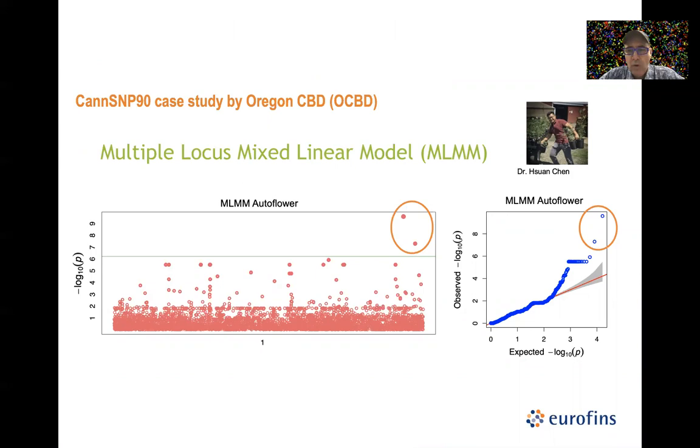After running all those SNP chips that we did a linkage map on, they were careful to select some other interesting cultivars. They looked for some cultivars of theirs that had the autoflower trait. This is important because if you can understand the autoflower genetics, you can get an extra crop cycle in the wintertime in the Northern Hemisphere. They also looked for another marker related to varin production in the cannabinoids. The varins are an altered form of cannabinoid with a shorter side chain. It ends up having a propyl side chain instead of a pentyl side chain on the molecule, and that is not as strictly regulated as THC. So if you can breed for plants that have varins, you can still get cannabinoids that aren't necessarily psychoactive but are still therapeutic, and those cannabinoids aren't regulated as tightly. So there's a really intense interest in understanding those genetics.